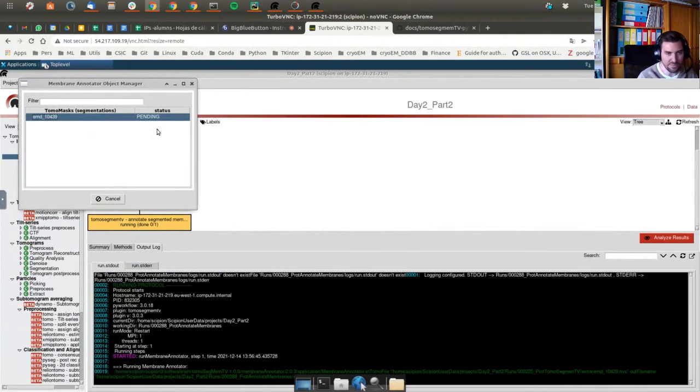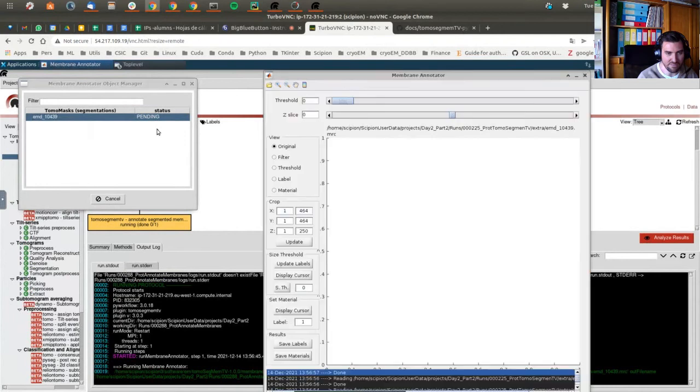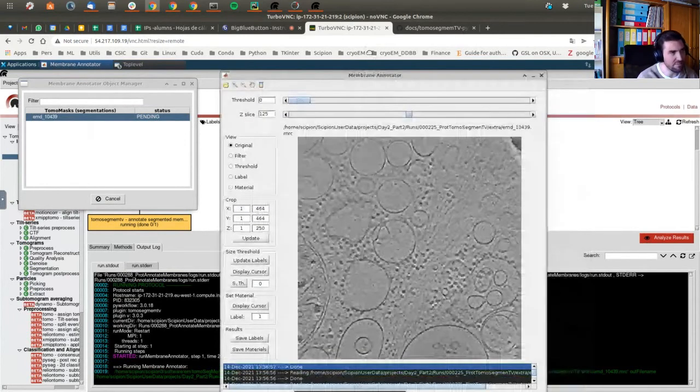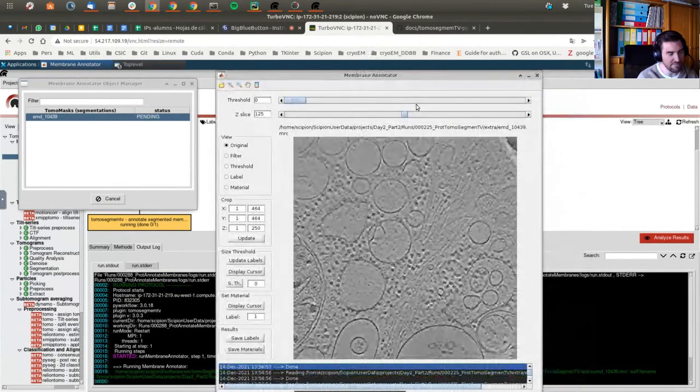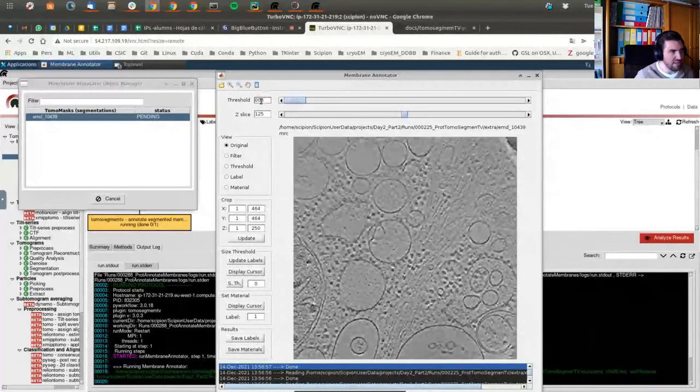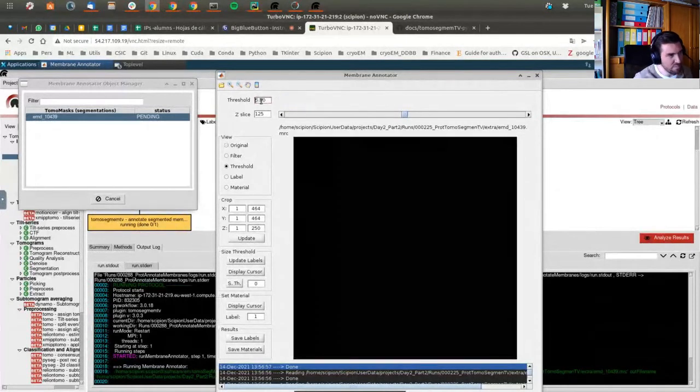So let's restart again. Sorry for the inconvenience, my fault. And the sizes will be, let's check them directly in the documentation until my problem with the cursors is solved. So I'm going to do it in a loud voice. The threshold should be 0.05.